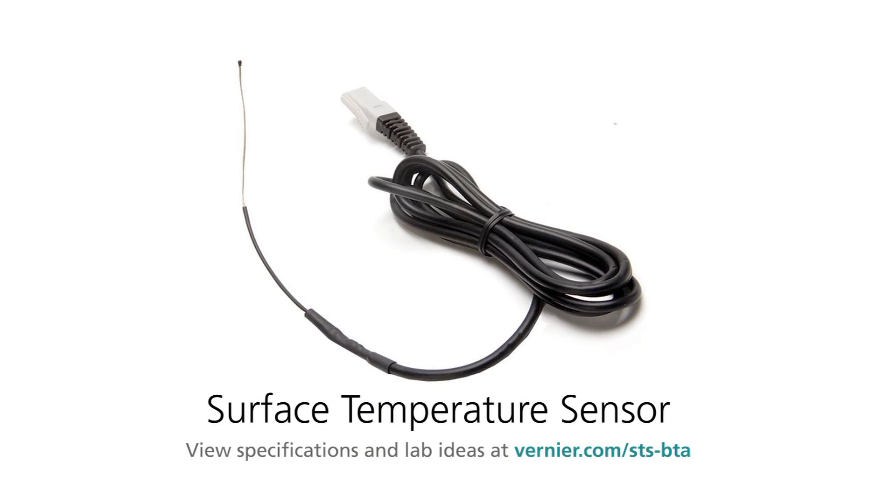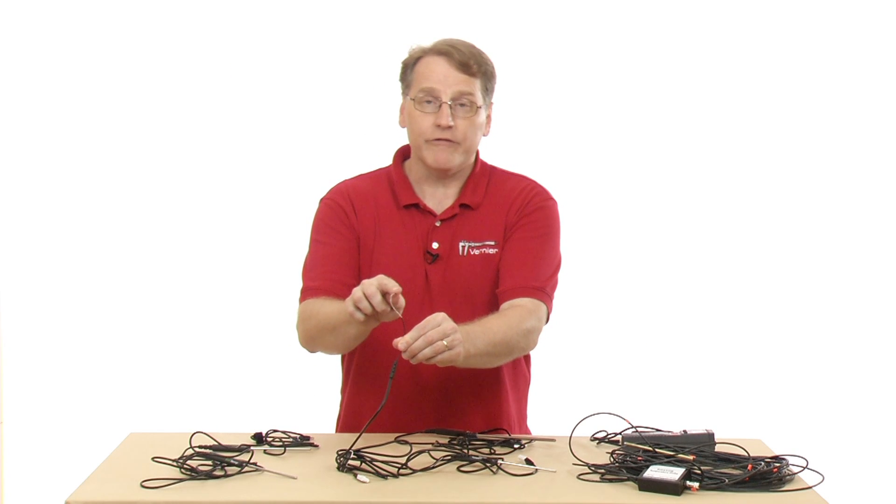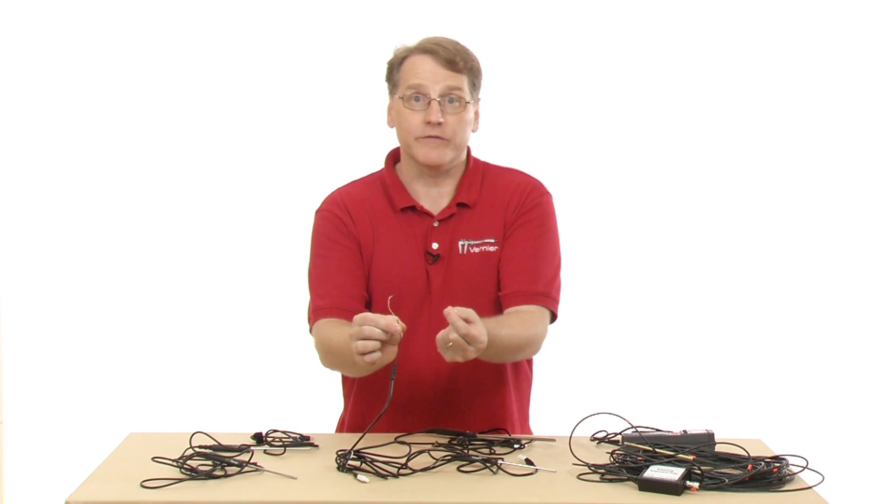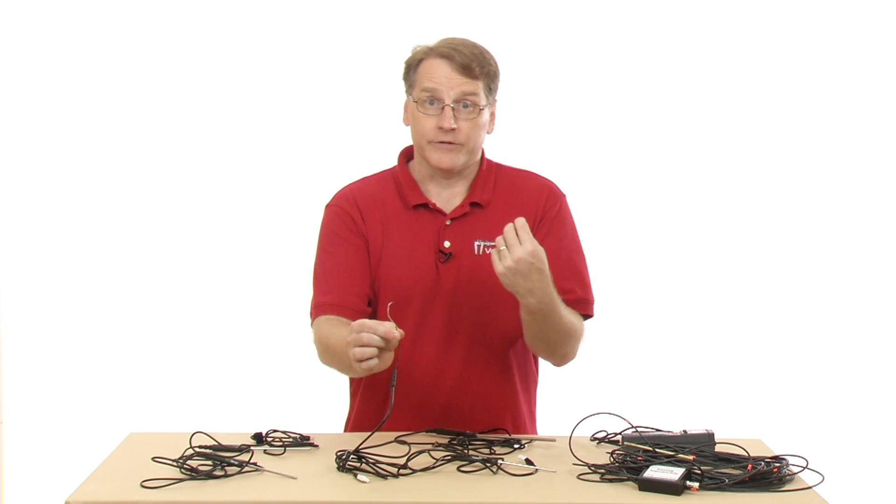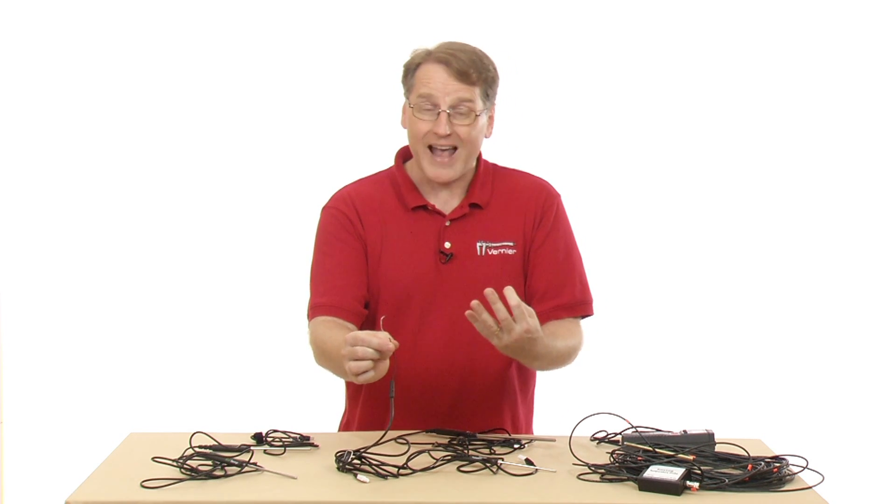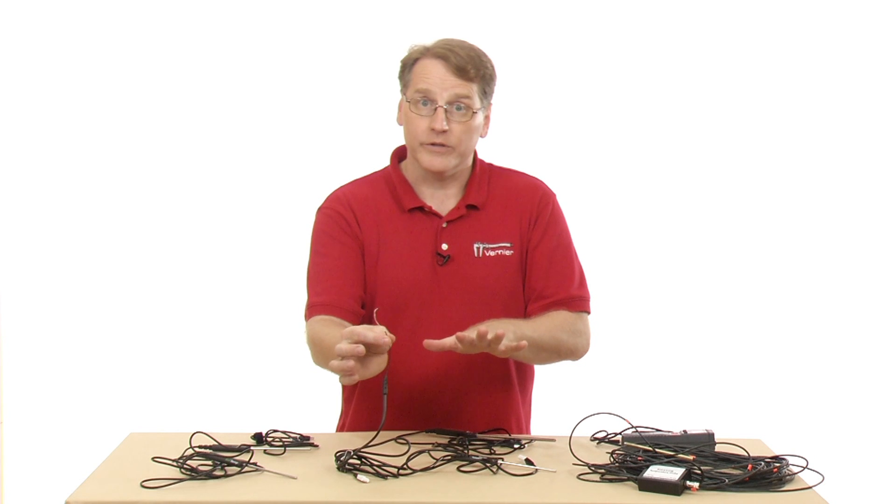Next would be the surface temperature sensor, and this one has a very fine wire that is very responsive to temperature. So its response time is much faster than some of the other sensors and probes.